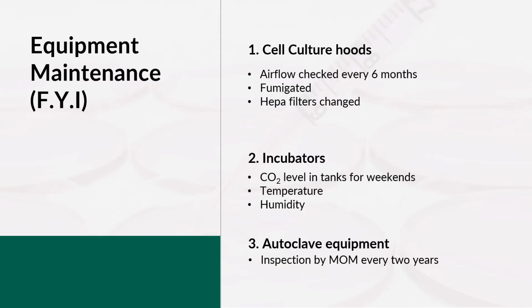Temperature-wise, they usually have a sensor that allows you to detect whether the incubator is at 37 degrees Celsius. So you should also check the sensors to ensure that they are working accurately. Okay, so you have to have regular calibration. You do a periodic calibration of the incubator to ensure that the temperature settings are accurate and consistent. Sometimes it might involve a calibrated thermometer that is able to verify whether the displayed temperature showing outside matches the actual temperature inside the incubator.